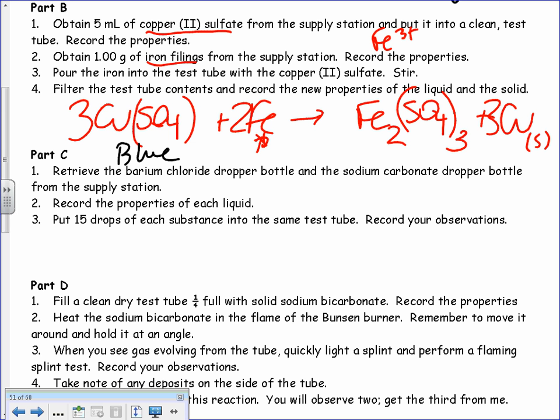What color did the black particulate stuff turn? Reddish orange. Well, it's not that it's turning a color. It's not iron anymore. It's actually copper because it's singly replaced. So there is no free iron anymore whatsoever, unless something didn't 100% react. But all that reddish copper colored stuff is just copper. That's it. So then all that blue color should have disappeared.